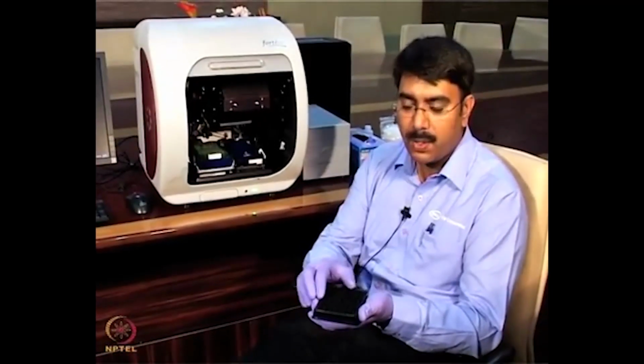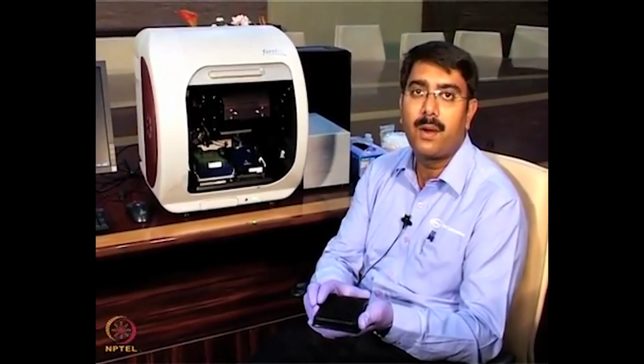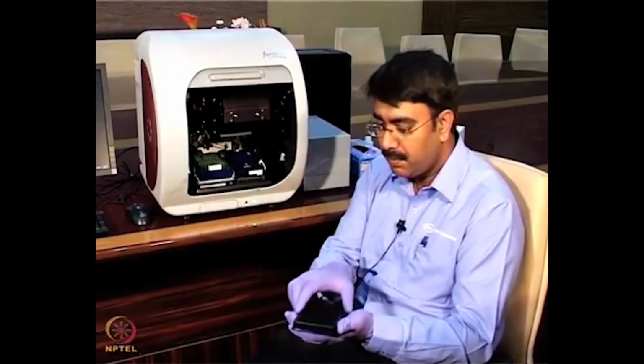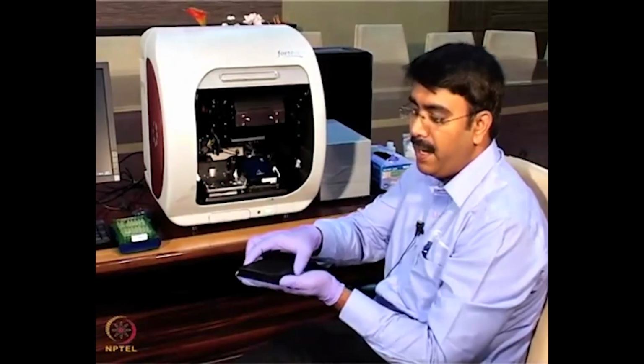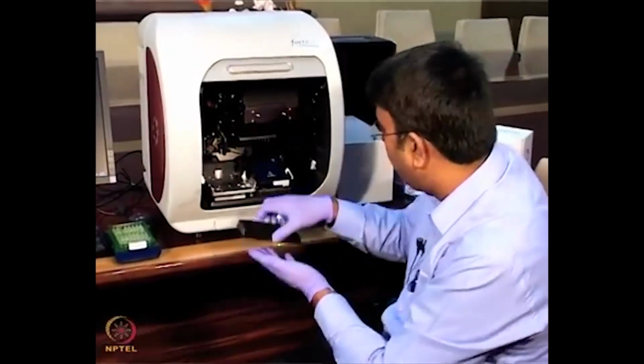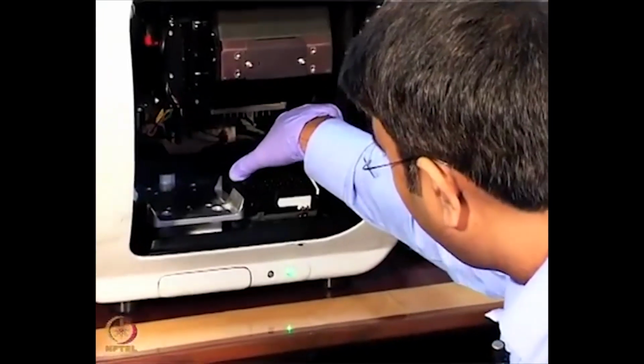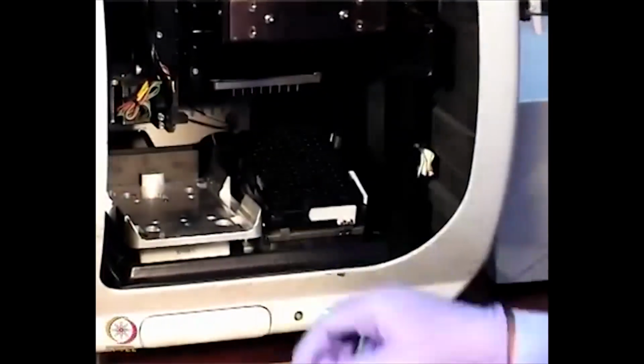And in the last wells I am going to put the analyte, that is 25 microgram per ml serially diluted in all these 6 wells. This is the sample plate, a 96 well plate. I am going to place it in the sample compartment here like this. There is a click sound, it fits firmly into the sample compartment.